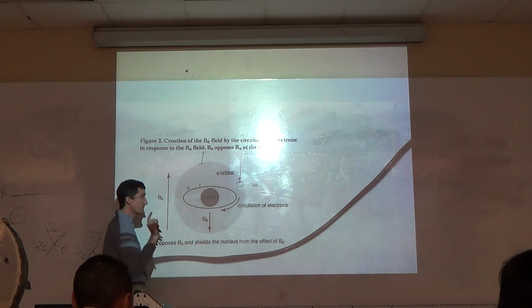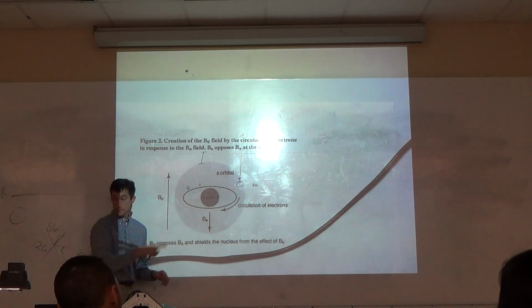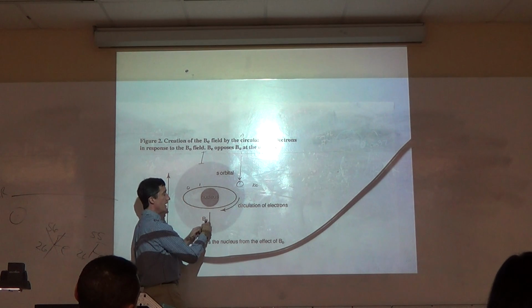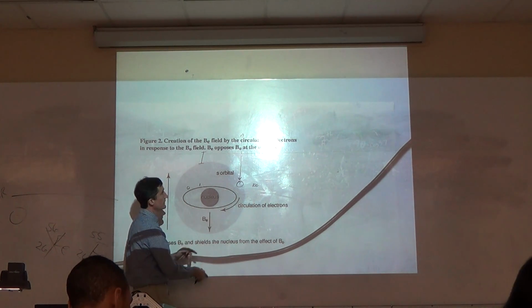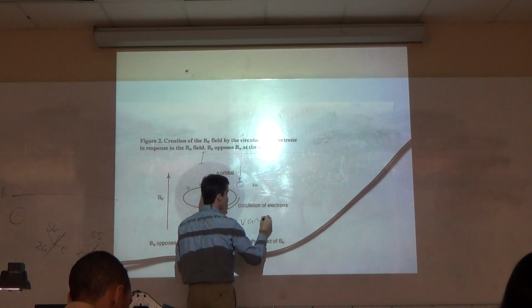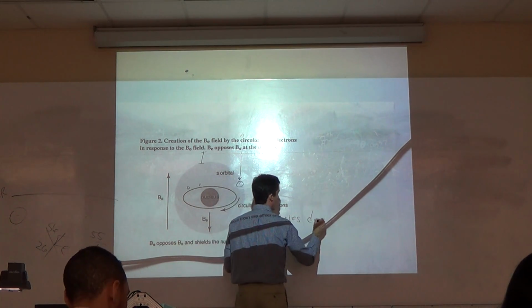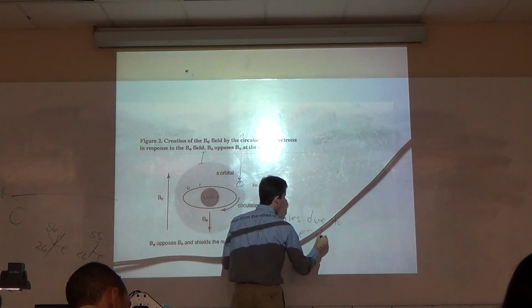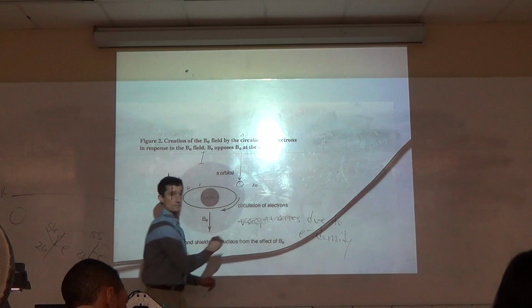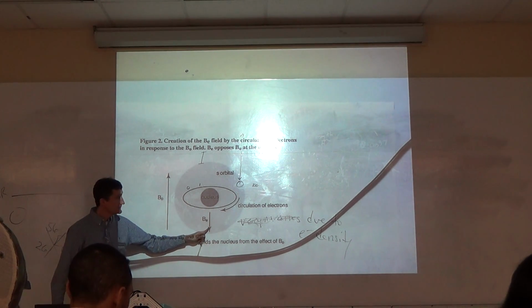Okay, but it turns out this is not going to vary, because this thing doesn't vary that it's in. But this does. Why does this vary? This varies due to electron density.